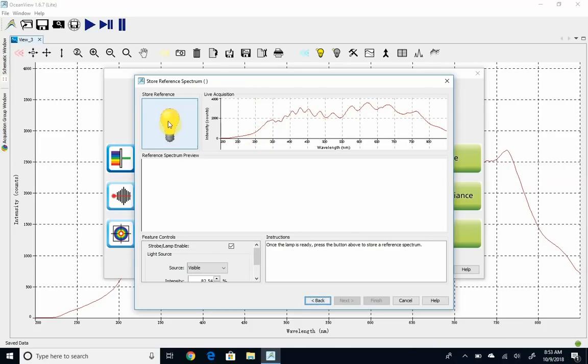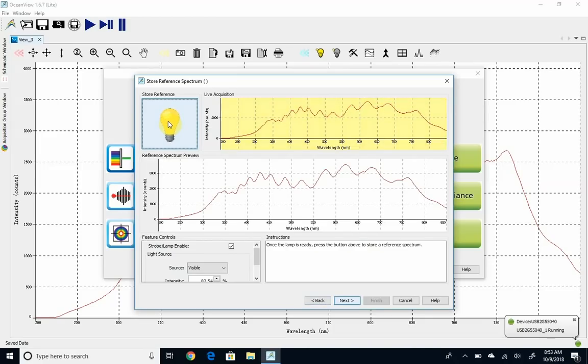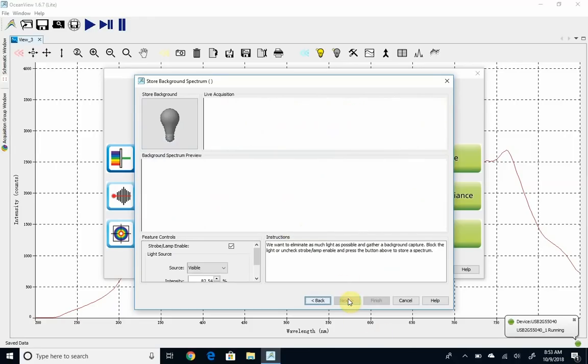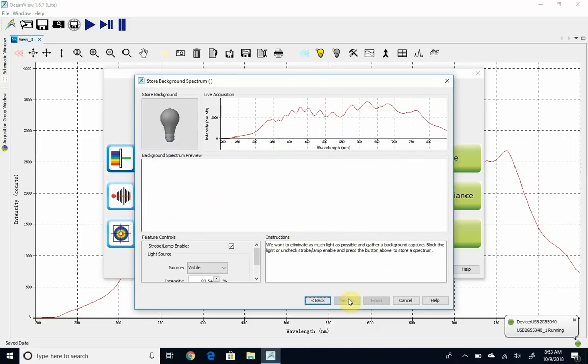But for now, that looks good. I'm going to go ahead. I've deionized water in there, so all the light is making it through. There's nothing in there absorbing visible light. Once you click it, you should see a spectrum down in this reference spectrum preview. If you don't see one, then go ahead and click the light bulb again.